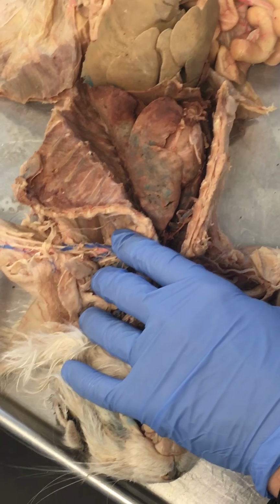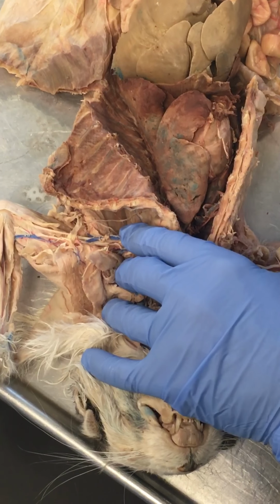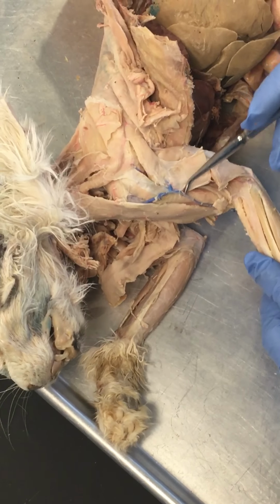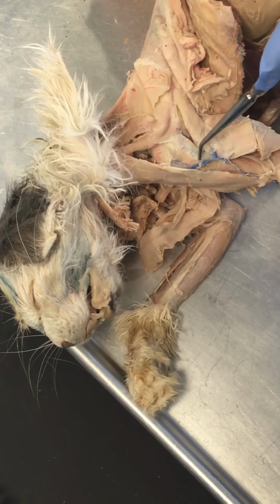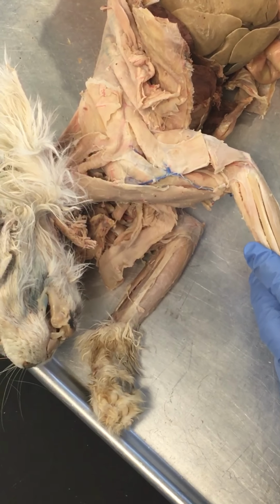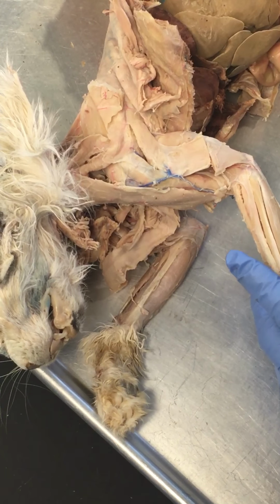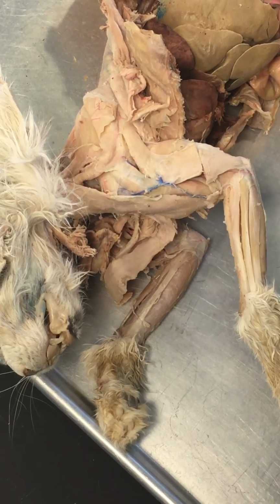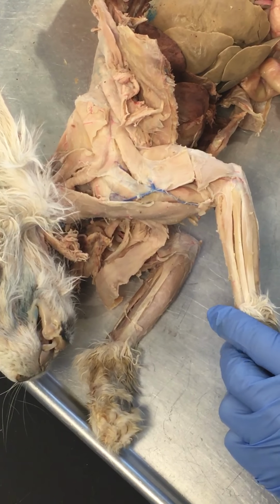Subscapular veins, you can get rid of those. Brachial veins, we just covered those. I want you to know those. Cephalic vein is also kind of a cool one. Cephalic vein is this dude right here, easy to find. So it's going to be on the outside of the shoulder, and down the outside of the arm. If you look at bodybuilders or people in really good shape with very low body fat, you can see that tortuous vein when they flex on the outside. That's cephalic vein.